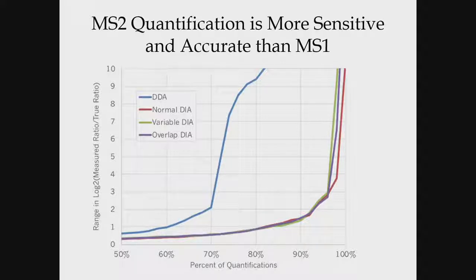We're working a lot on methods that allow us to narrow down the isolation width without increasing the cycle time or decreasing the mass range. Do you suggest having separate methods for identification and quantification? Bingo, yeah. We'll talk a lot about that on Thursday. In our lab, we've separated the detection from the quantitation, and we'll talk a lot about that on Thursday. That's a great point.